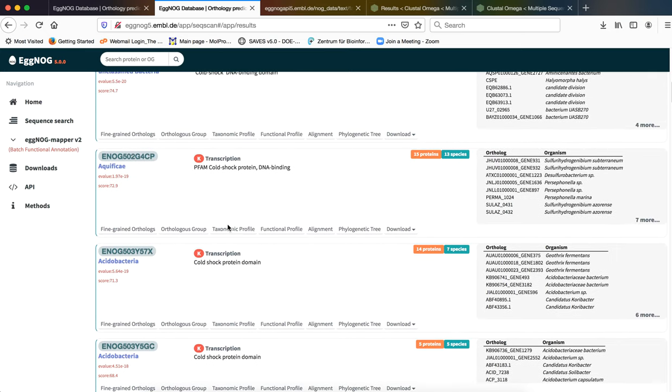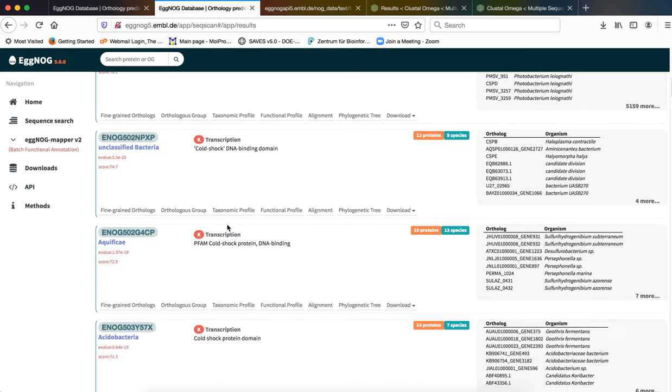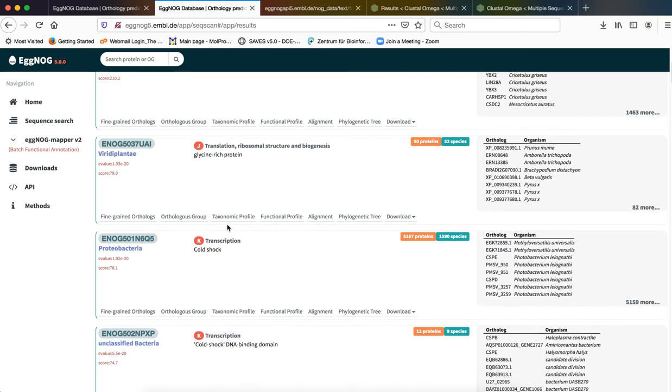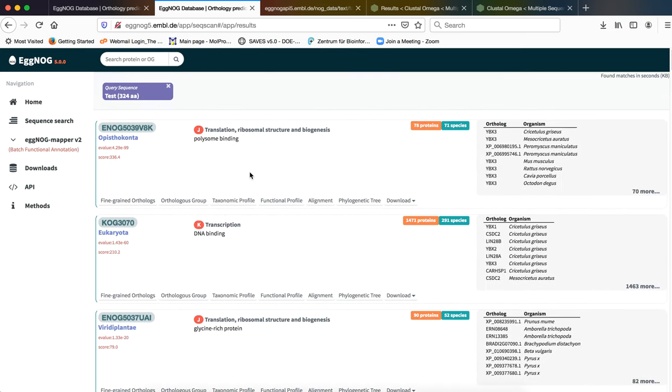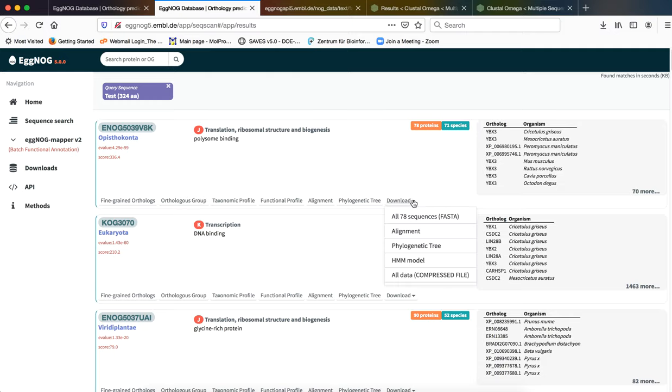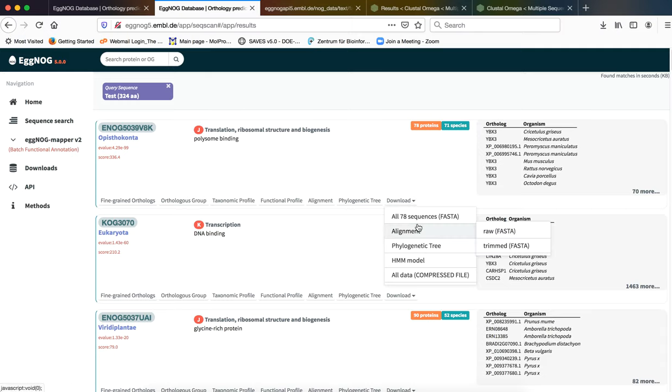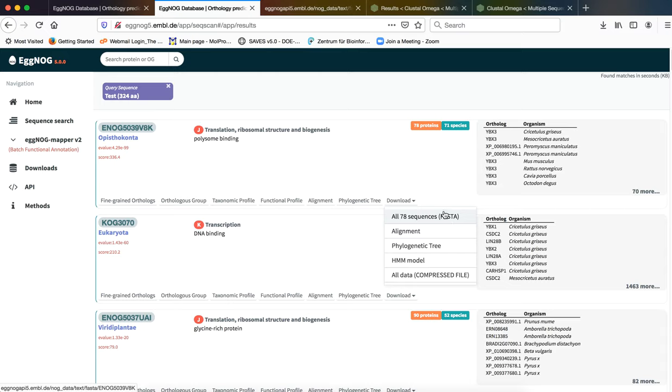What we need to do from this particular segment, since we are focusing on the most prolific orthologous group which is Opisthokonta, what we will do is we will try to download the sequences corresponding to Opisthokonta. There are 78 sequences and all of these sequences are available in FASTA format.